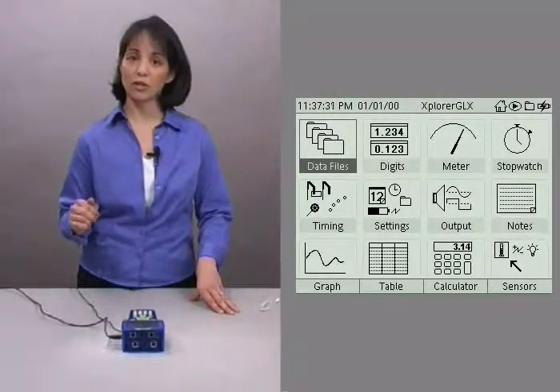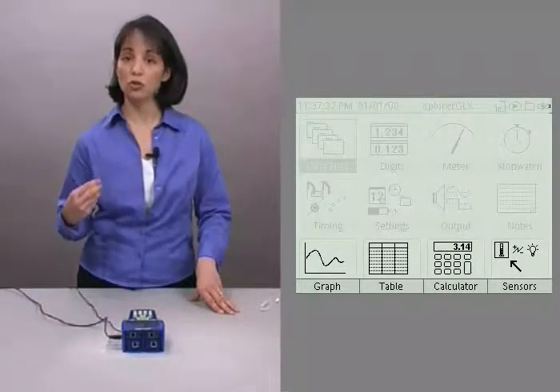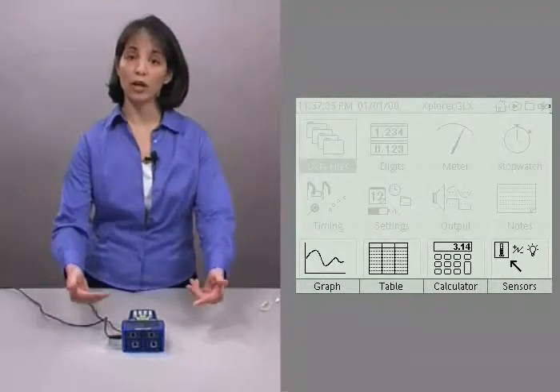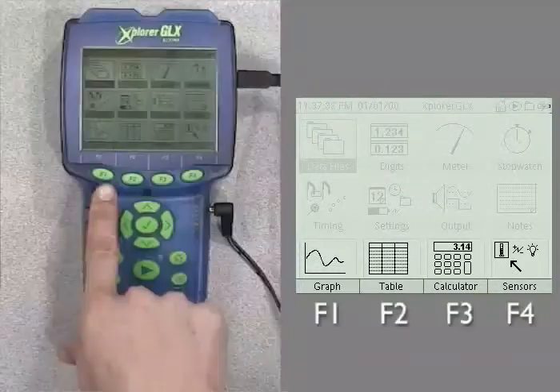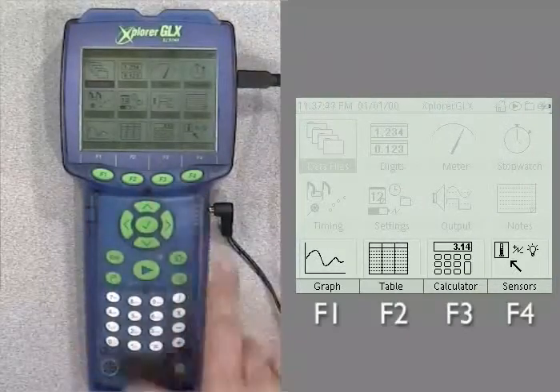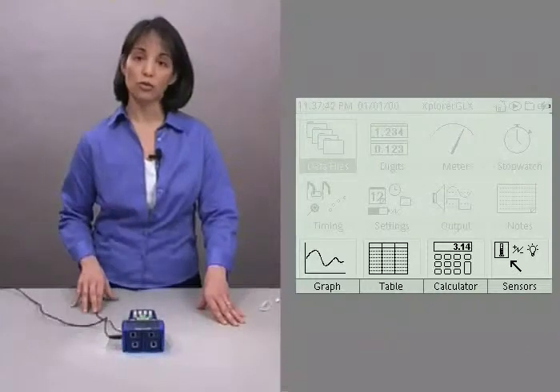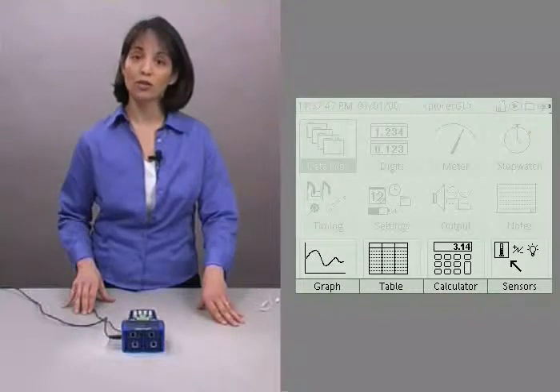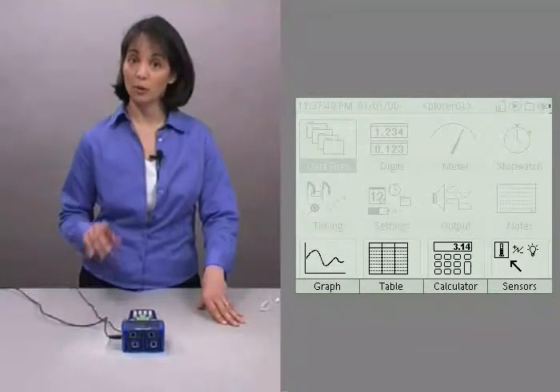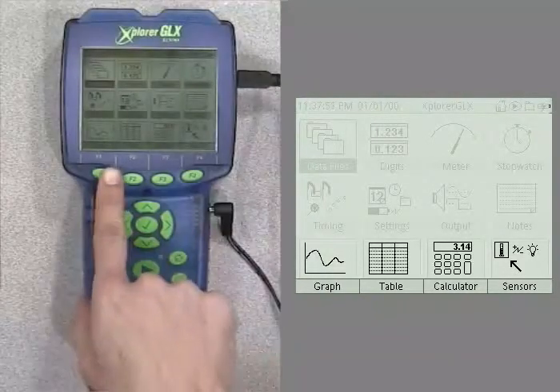For even easier access, the four most commonly used screens have been placed on the bottom row of the home screen and associated with one of the function buttons underneath it. In order to get to that screen, just push the button and there you go. So let's go ahead and open up a graph display by pushing the F1 button.